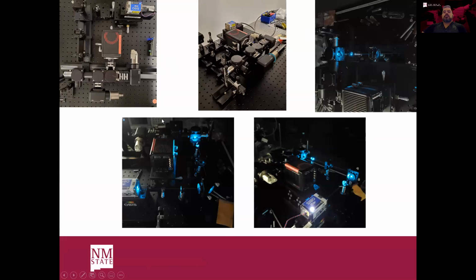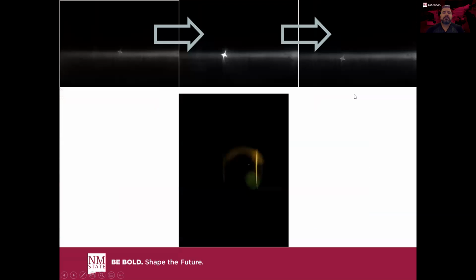Now, this is just showing the progression of the current system, bird's eye view, and of course, this is the system in operation here. As we were testing and calibrating, in this case I believe I was calibrating the fluorescence PMT. There is a regime that you can create where you are acoustically trapping the particle for prolonged interrogation.